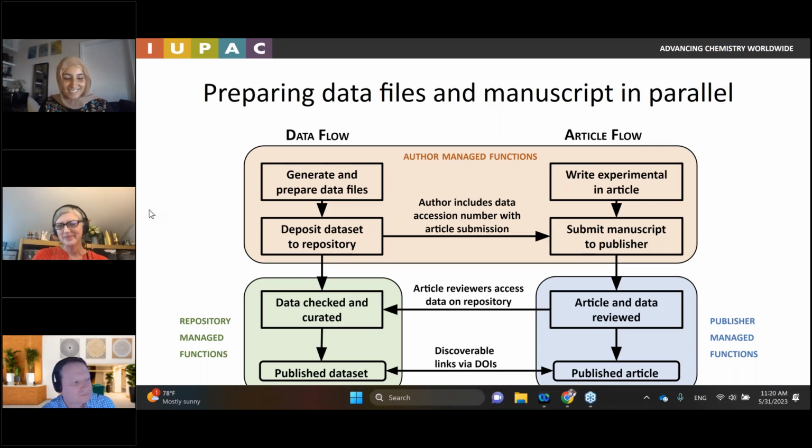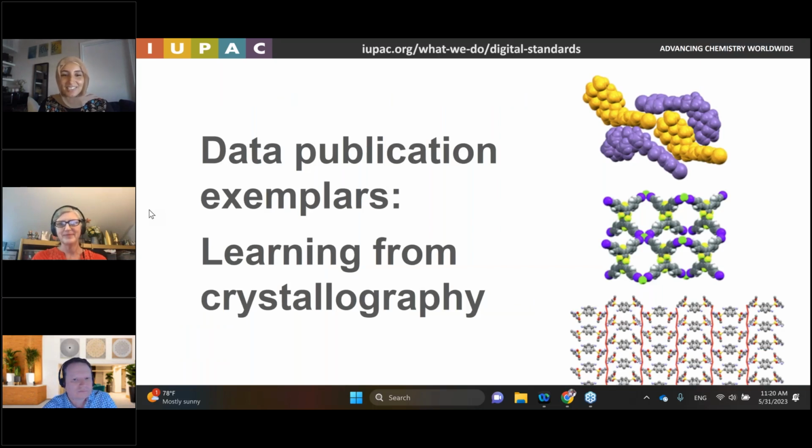Thank you, Leah. So taking an example right now for the standard data files and specifically for the crystallographic information file, the CIF file. Ian, you have been working with the CCDC for decades right now, and you have been working with this data file to add any new chemical crystallographic information to your databases. Would you tell us more about this case of having a very well-established standard file structure for archiving and distribution of the crystallographic information? Certainly, yes.